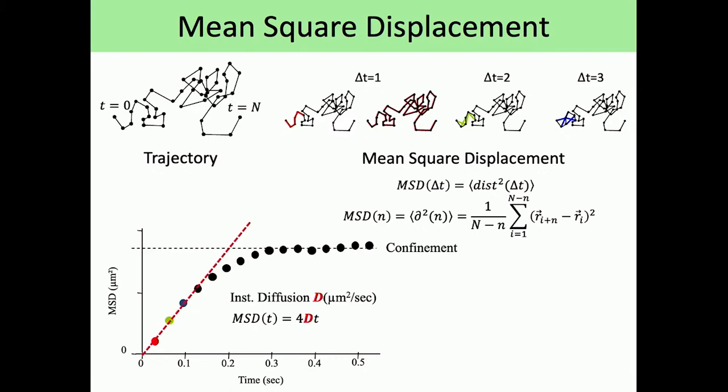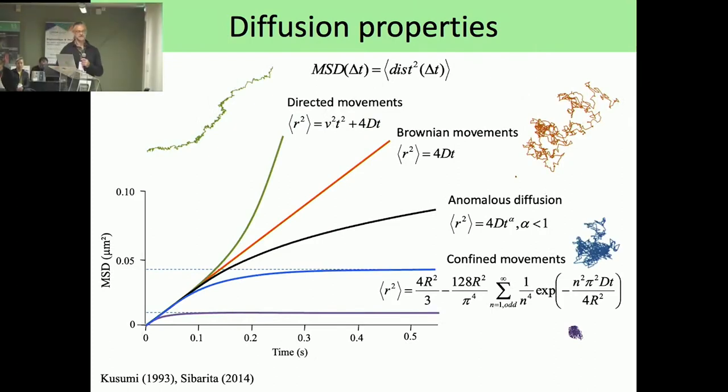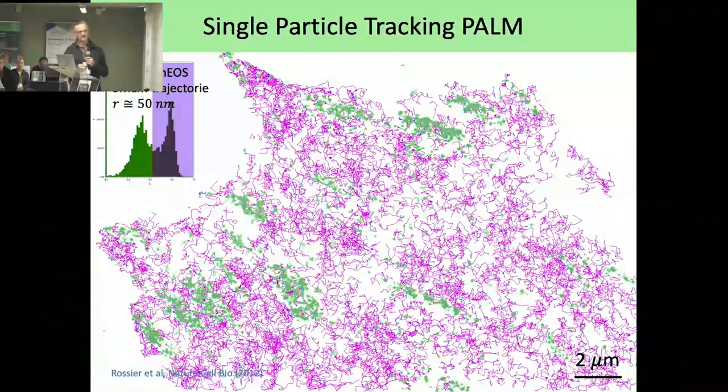And of course, this is characterized way longer before super-resolution, because the field of single particle tracking, again, has been presented rapidly by Cyril. So these models exist, and they work pretty well to classify your molecules. And this is typically how we ended with this kind of map.